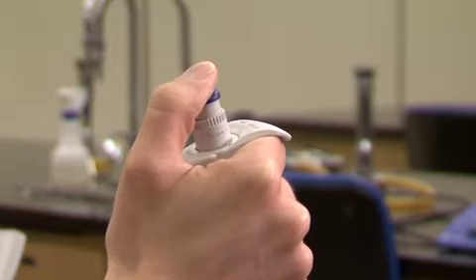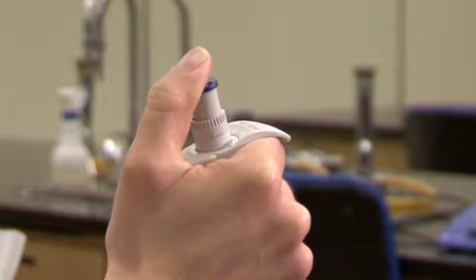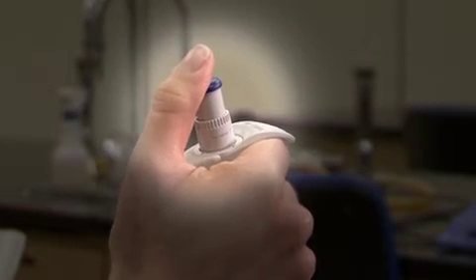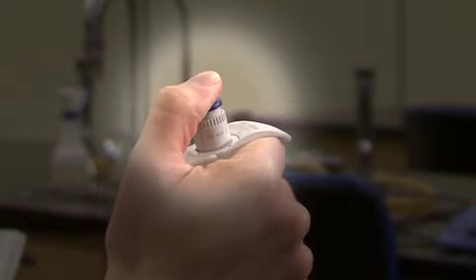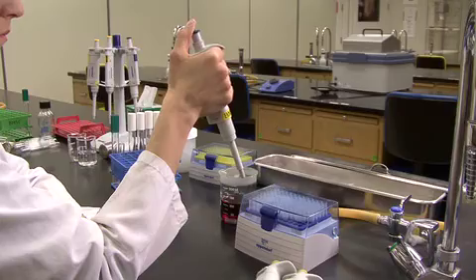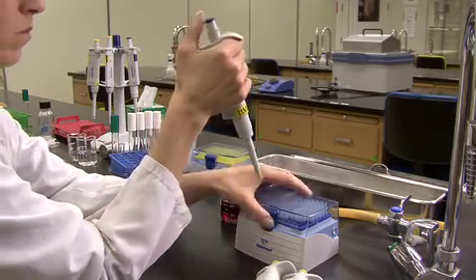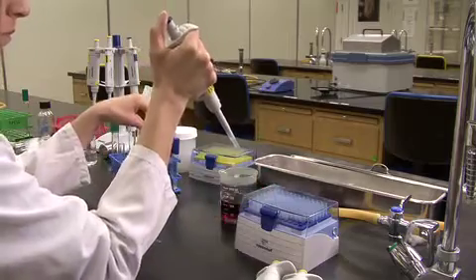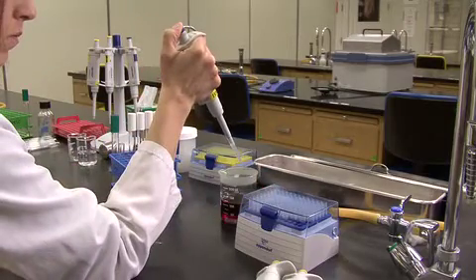Each micropipette plunger has two stops, which can be thought of as two springs within the plunger. The first stop utilizes a weak spring and is easy to compress, while the second stop has a firmer spring, which is harder to compress. To measure a liquid, you will only be pressing the plunger down to the first stop. This expels a volume of air equal to the volume of liquid you want to measure.